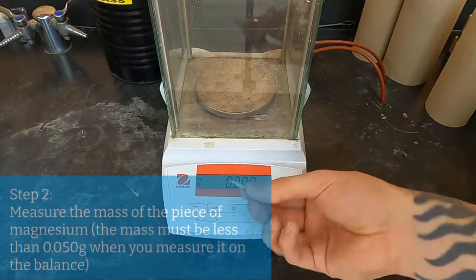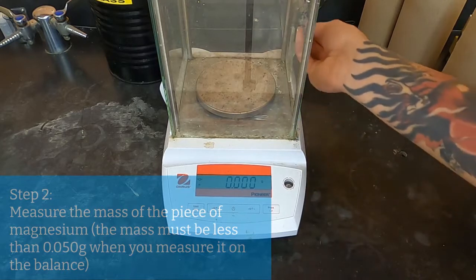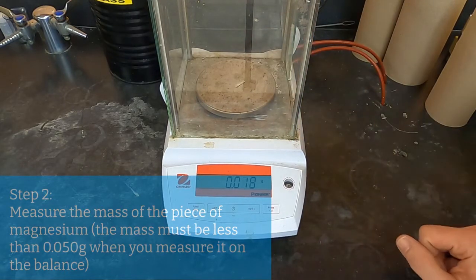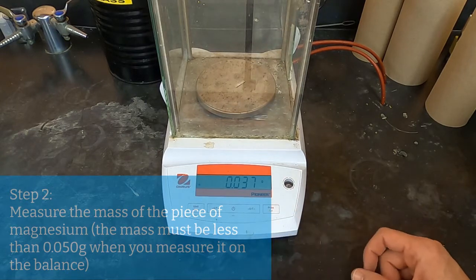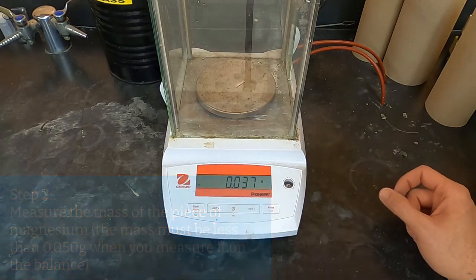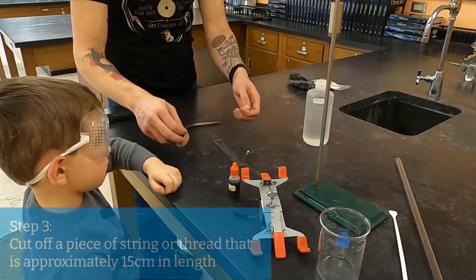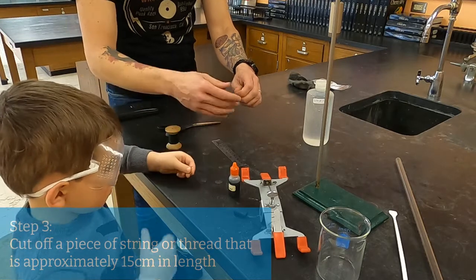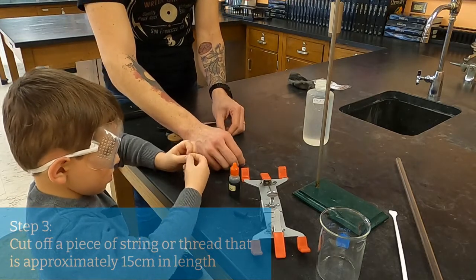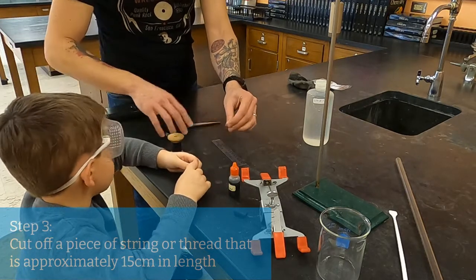Next, you're going to measure the mass of your piece of magnesium. So you've got 0.037 grams of magnesium. This length of string is going to hold your magnesium in place while it reacts so it doesn't float. The length you need is going to be approximately 15 centimeters.